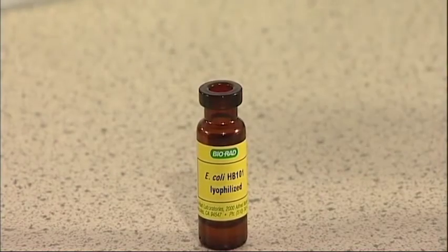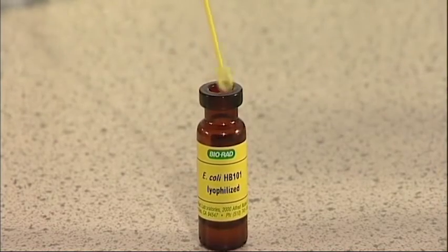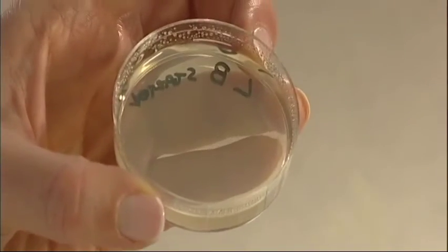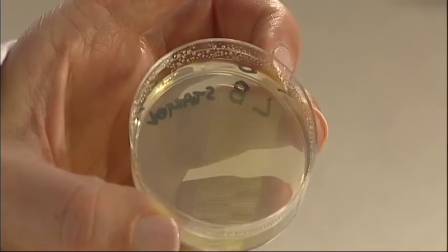To streak the starter plates, take a fresh inoculation loop and dip it into the rehydrated E. coli. Run the inoculation loop over the first quarter of the starter plate.